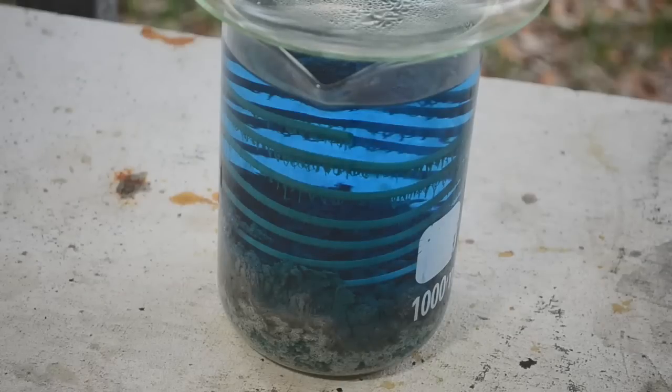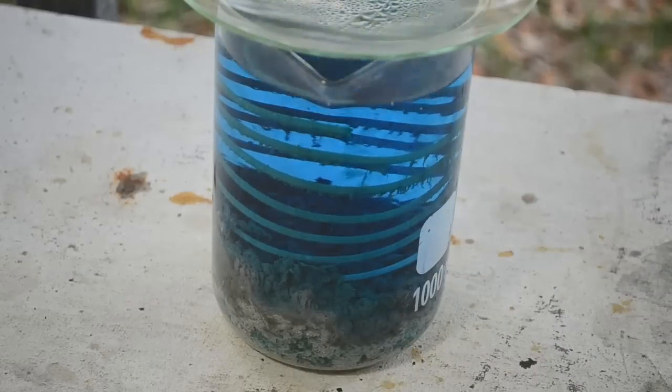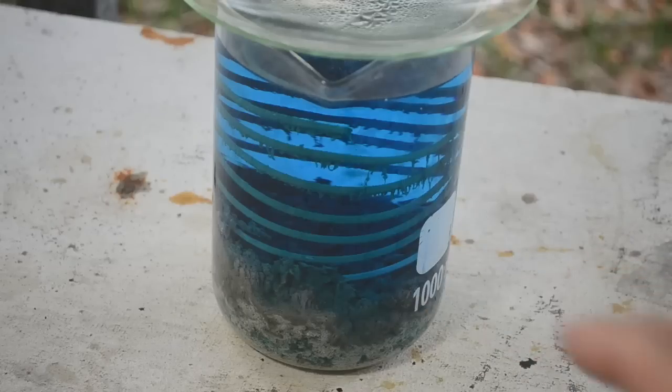Well, it's the next day. This has sat there cementing out overnight, and it looks like the reaction's pretty much done. There's just a few little, you know, tiny little snot-like stalactites hanging down from the copper anymore. I'll have to shake it really well, pull the copper coil out of there, shake it really well, and wash the silver off that's stuck to it, and then we can get to cleaning this stuff up.